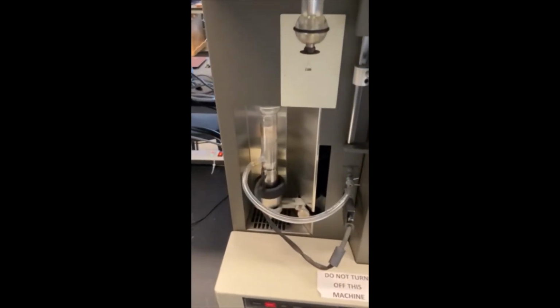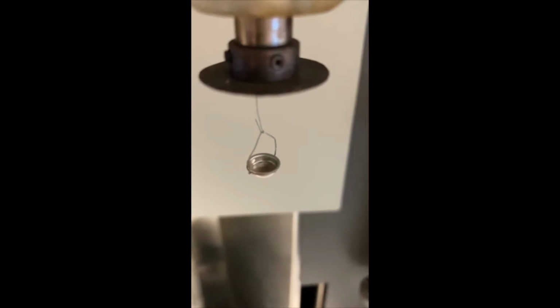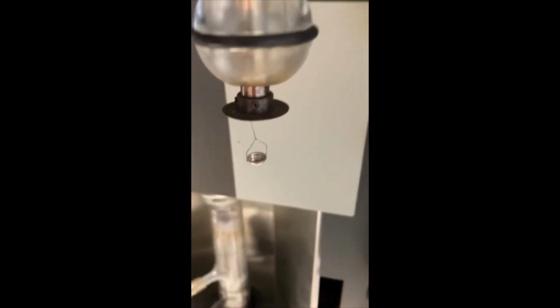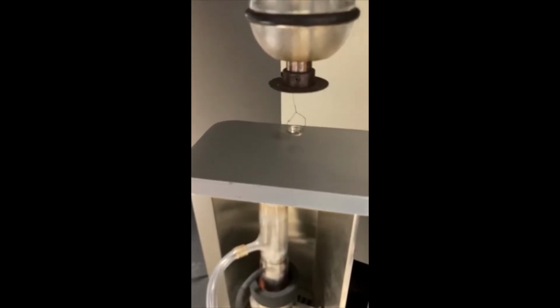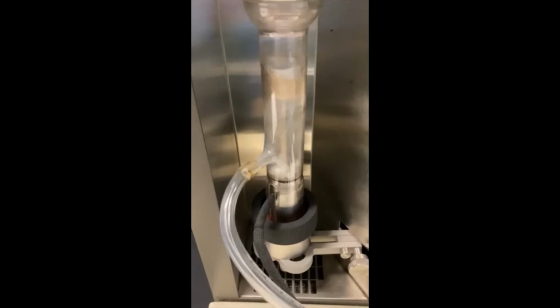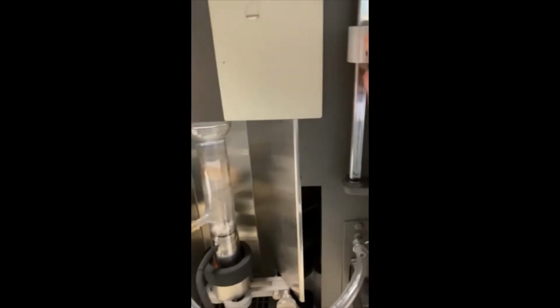So what is a ThermoGravimetric Analyzer, or TGA? It's really a precise balance placed inside of a furnace. For the measurement of a material's Curie temperature, we use a magnet to impose a magnetic attraction to a room temperature ferromagnetic sample, which acts to pull on the sample due to the attractive moment present in the ferromagnetic sample. In other words, it makes the sample appear heavier on the balance.